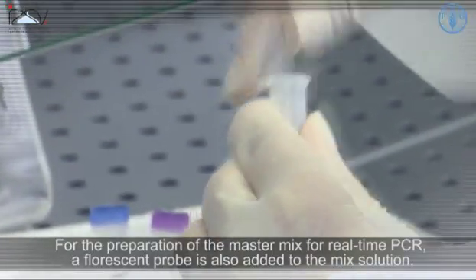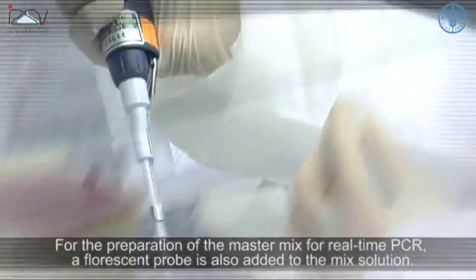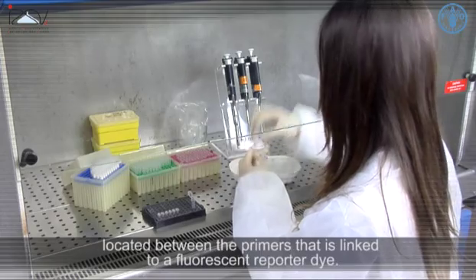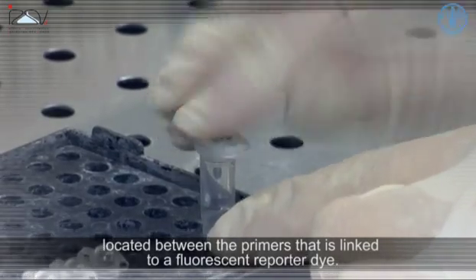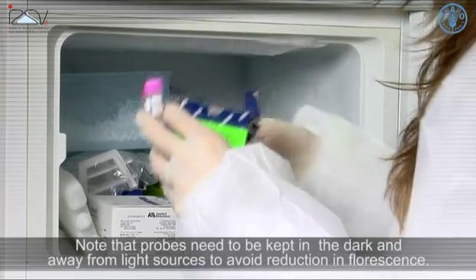For the preparation of a master mix for real-time PCR, a fluorescent probe is also added to the mix solution. This is the short nucleotide sequence complementary to a target sequence located between the primers, that is linked to a fluorescent reporter dye. Note that probes need to be kept in the dark and away from light sources to avoid reduction in fluorescence.